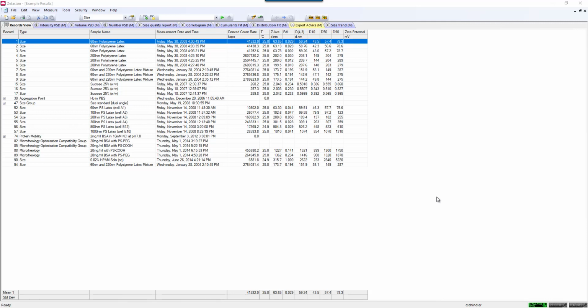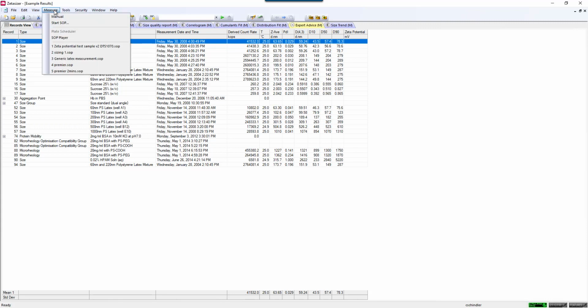This is a video showing how to do some automated measurements or time temperature studies with the Zetasizer Nano series software. So the tool that we'll be using for this is in Measure, and it's the SOP Player.